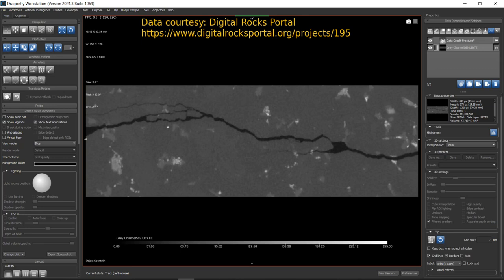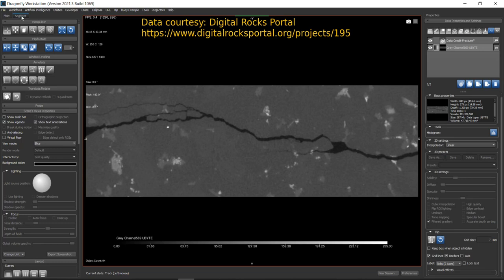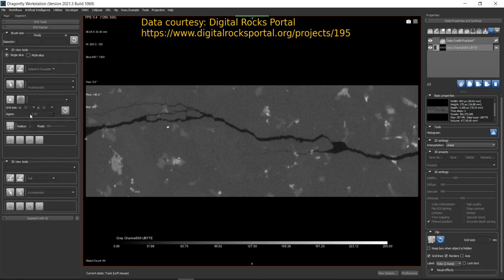Now let's see where to find the ROI Painter. On the top left you will see two tabs: Main and Segment. Go to the Segment tab and you will see three panels: ROI Tools, ROI Painter, and Segment with AI. Our focus today is the second panel, which is the ROI Painter.